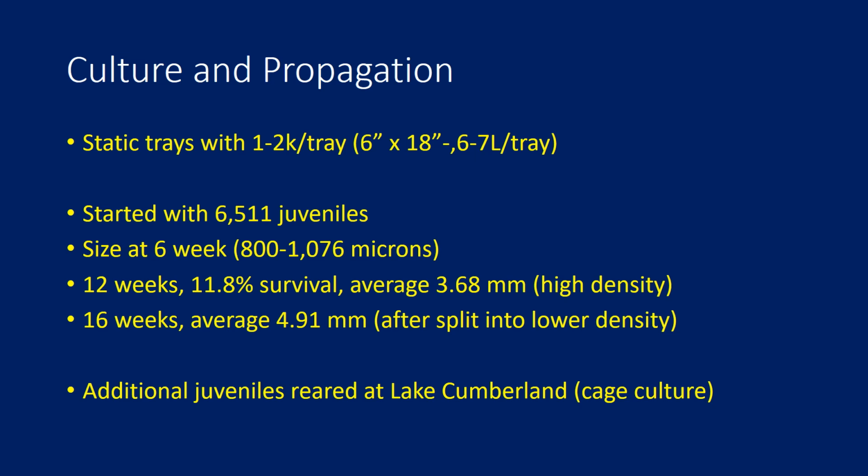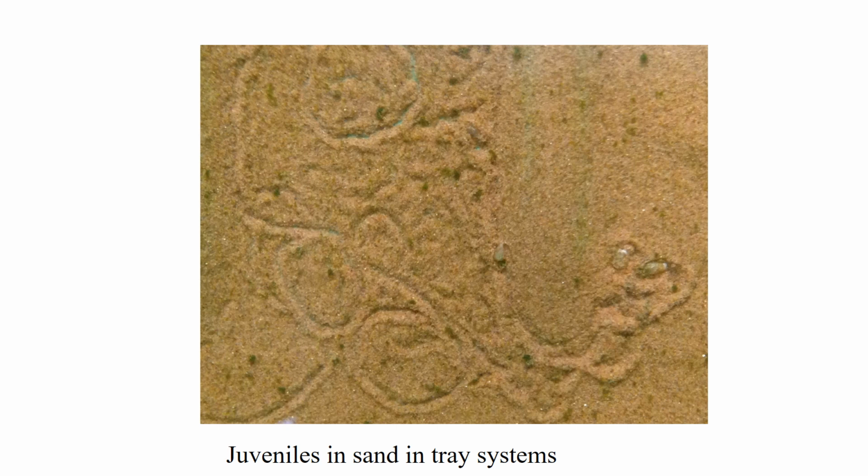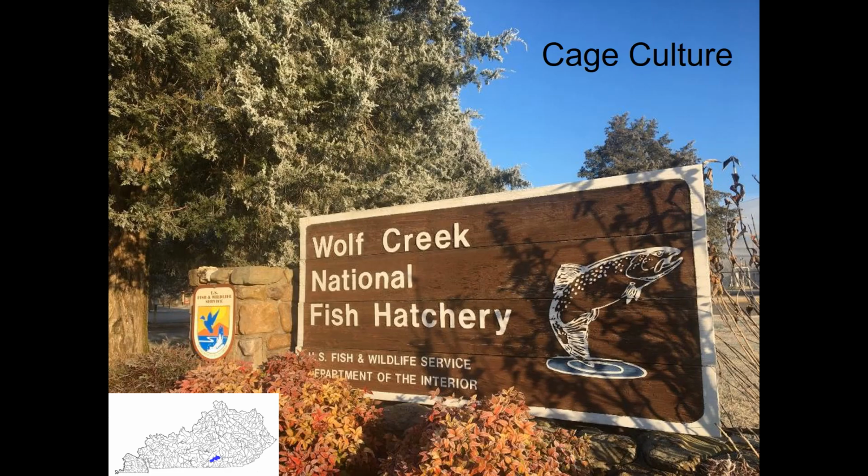We also added additional juveniles to Lake Cumberland cages, which is another approach that we use to rear animals. Here are the grow out systems we use for the small 2-gallon trays. We fed a mixture of freshwater and marine algae, 2 parts freshwater and 1 part marine. We raised the freshwater algae, and we purchased the marine algae. Here's what the juveniles look like after a few months growing in the trays in sand.